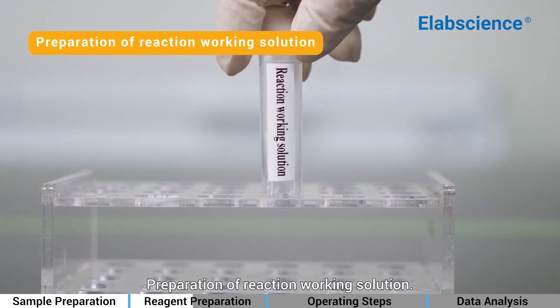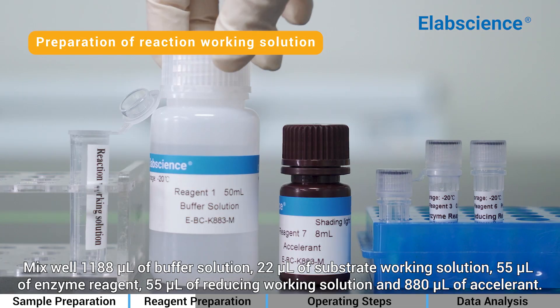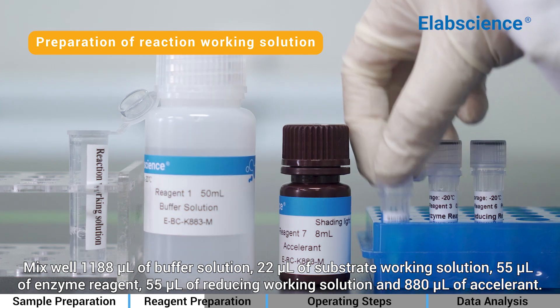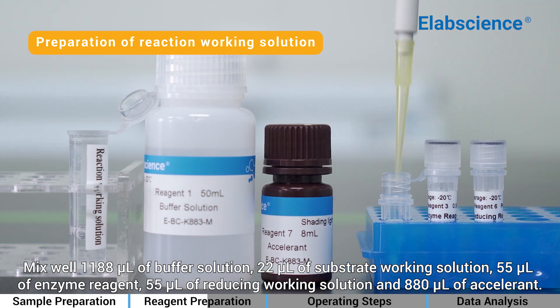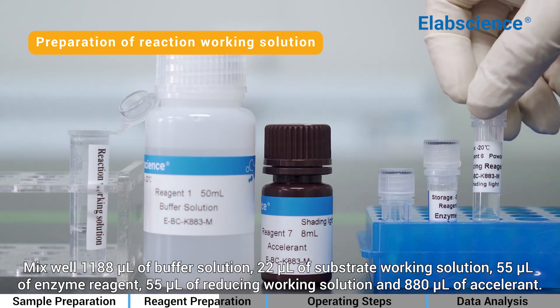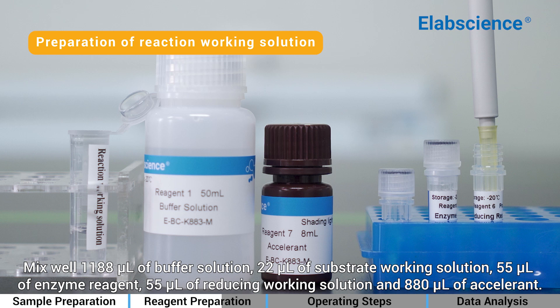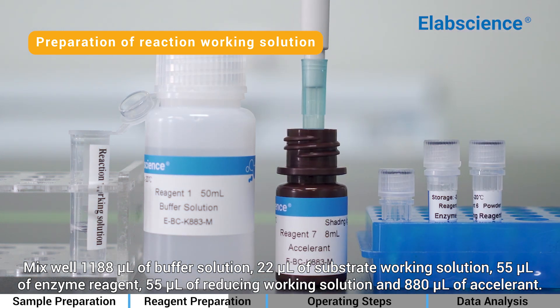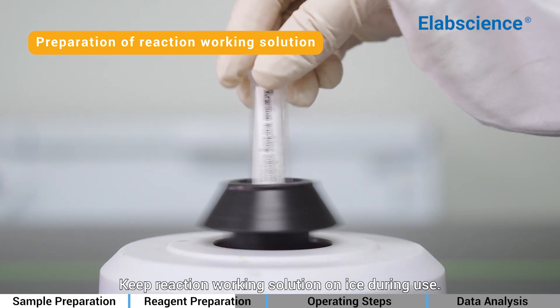Preparation of Reaction Working Solution: Mix well 1,188 µL of buffer solution, 22 µL of substrate working solution, 55 µL of enzyme reagent, 55 µL of reducing working solution, and 880 µL of accelerant. Keep reaction working solution on ice during use.